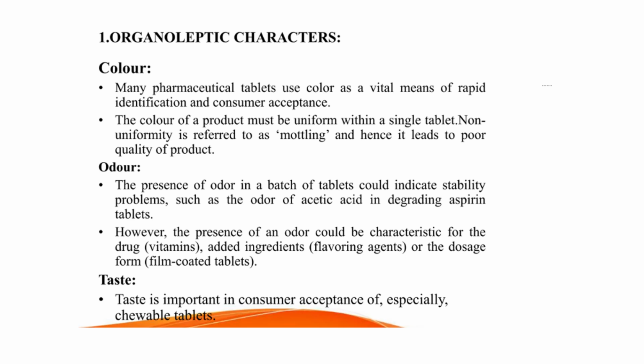Non-uniformity of the colors on the surface of the tablet is a defect known as mottling, where the colors separate or patches of color are produced on the tablet. We should ensure that the color on the surface of the tablets is uniform.